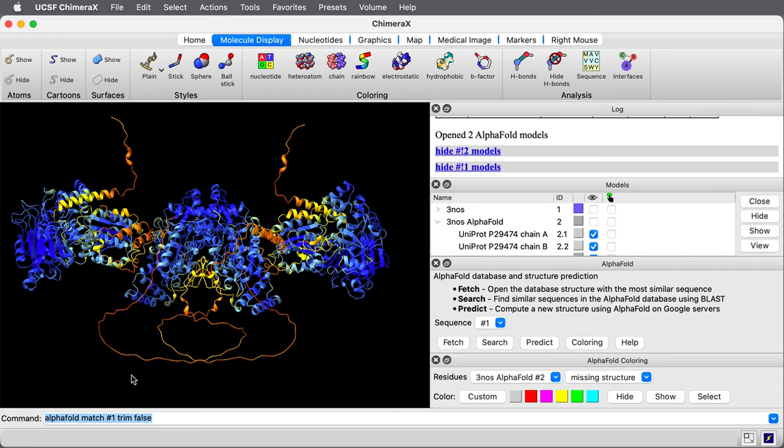There's some large loops where alpha fold didn't predict any order. You see that often, and it may be those regions really are disordered or only ordered when they interact with other proteins.